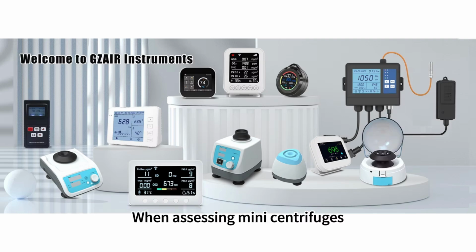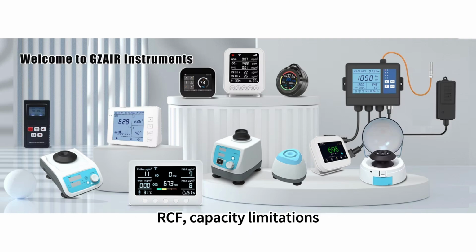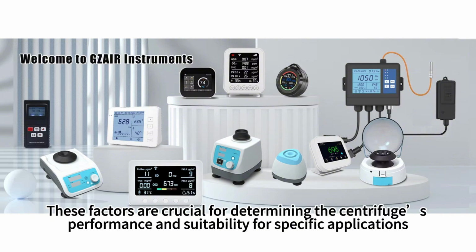Conclusion: When assessing mini centrifuges, consider key technical parameters such as maximum speed, RCF, capacity limitations, rotor compatibility, temperature control, noise level, and safety features. These factors are crucial for determining the centrifuge's performance and suitability for specific applications.